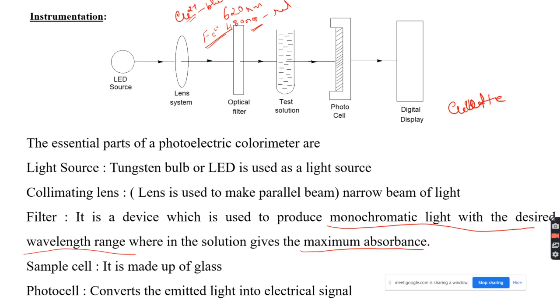This cuvette tube is usually made of glass, just to hold the solution. We use samples whose thickness is the same, because during the experiments we keep L constant. That's why we use the same thickness of cuvette tube throughout the experiment.